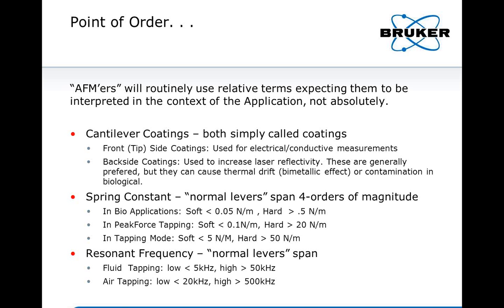These coatings are generally preferred as they mitigate some of the common image artifacts, but it should also be noted here that in some cases the coatings can in fact induce drift or contribute to contamination. The spring constant as well is very application context specific. What is soft in one application may be hard in another. This is similarly true for high versus low resonant frequencies. So in general, when talking about probe qualities, we want to make sure that we do so within the context of the application for which the probe is being used.